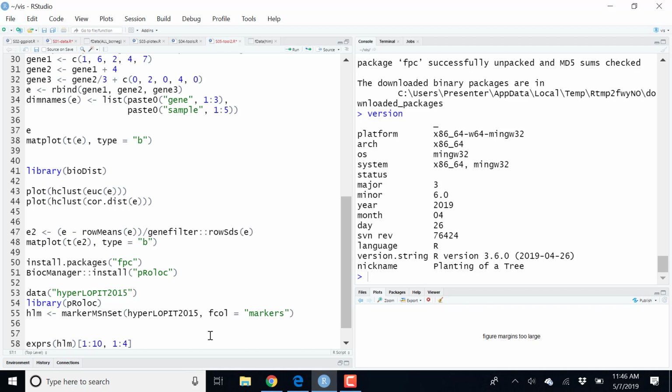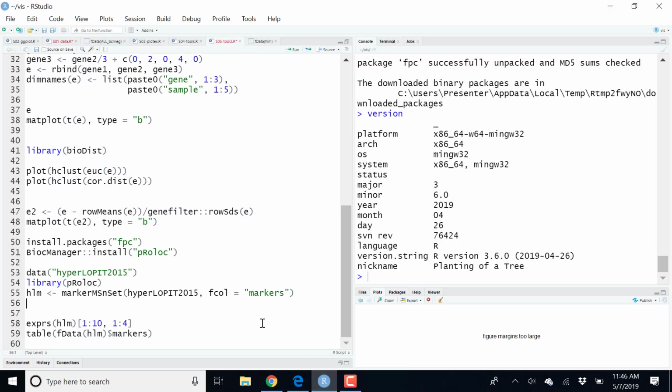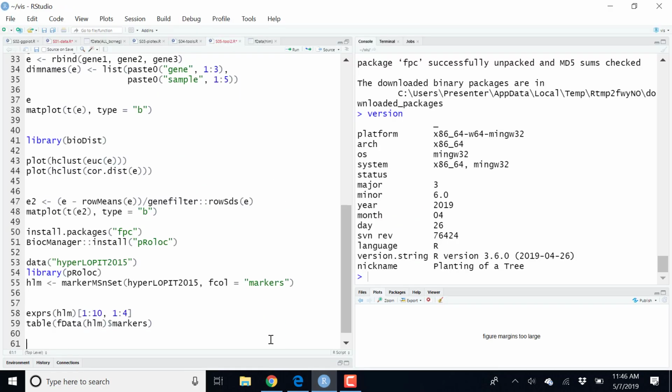It's the worst thing you could install manually. So I went with remotes, you can install a version and just pick one older version. And that works on CRAN. You can specify it on CRAN. It did, but there were some issues installing further dependencies, but in the end it worked. I don't know if it worked. And we need that for the pRoloc package.